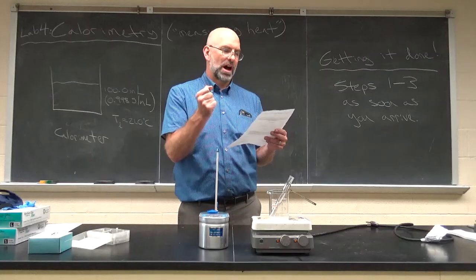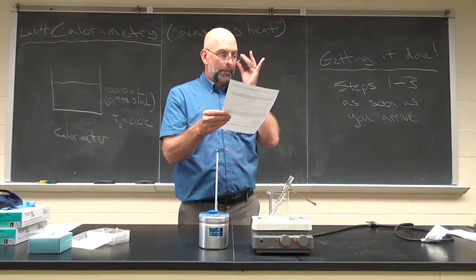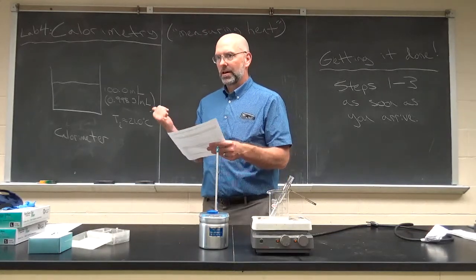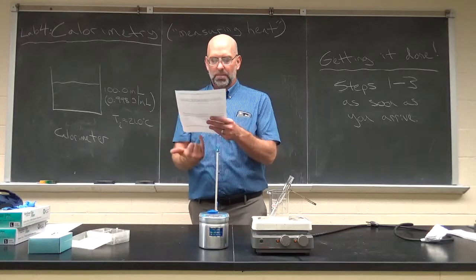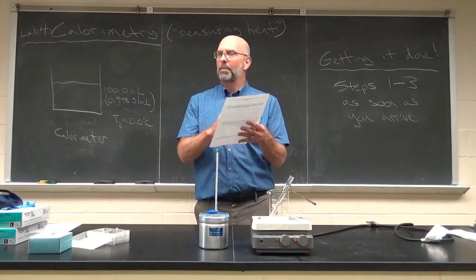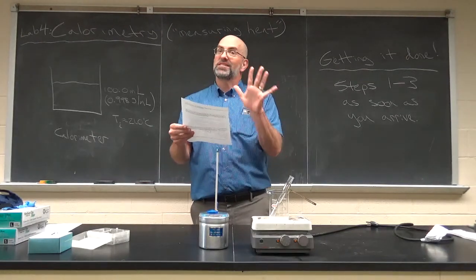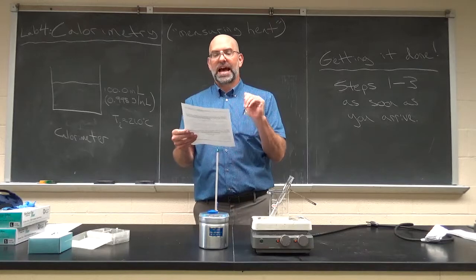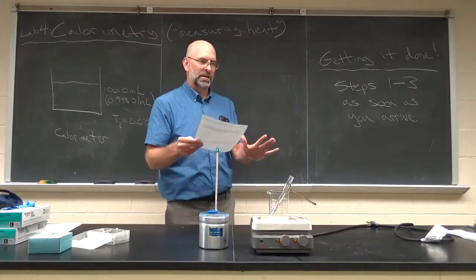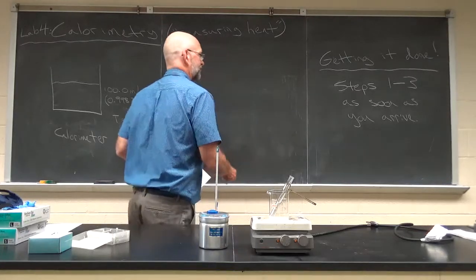I'm going to talk about trial number 1 with 100 milliliters, take you through the procedure, but actually more importantly, go through the math. What are we doing here? The math is on the back, and it's all spelled out, but I want to go through this step by step and show it to you how this works and give you a little bit of a heads up. I'm not going to do any of the math. I'm just going to kind of outline it for you. Again, stop the video if this is all you have time for pre-lab. Now we're kind of going into pre-lab, post-lab mode.